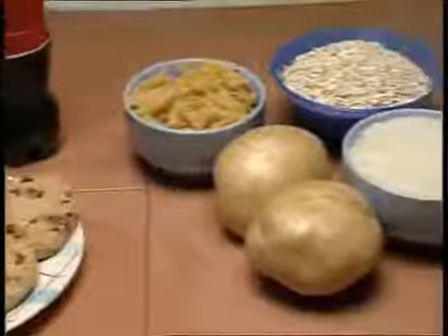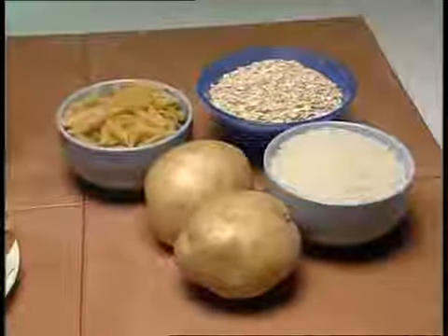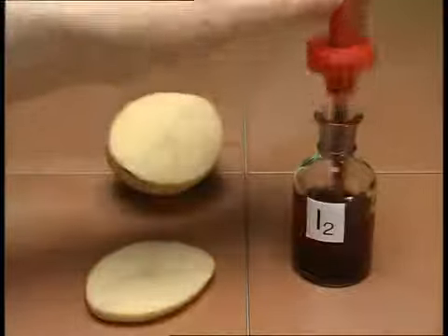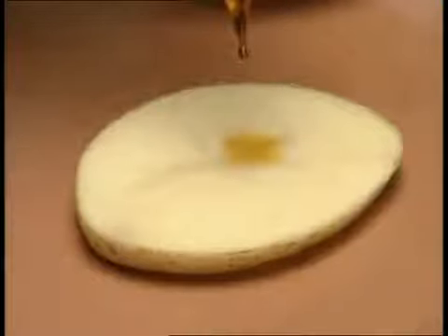Starchy carbohydrates are found in foods like pasta, potatoes, cereals and rice. A few drops of iodine solution produces a colour change from orange to blue-black. This indicates the presence of starch.